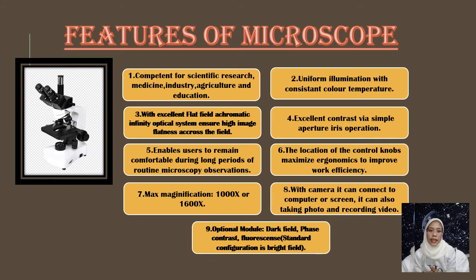Number 6 is the location of the controls to maximize ergonomics to improve work efficiency. Number 7 is magnification. The magnification of the microscope is 1000 to 1600 magnification.